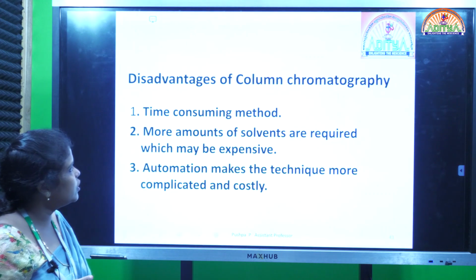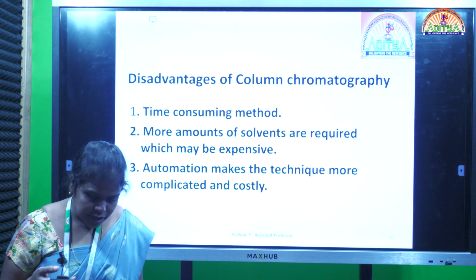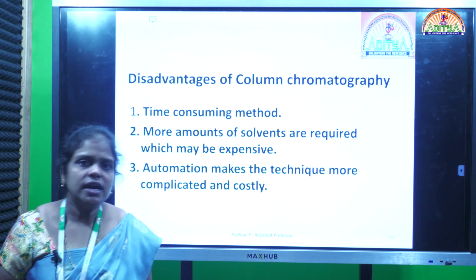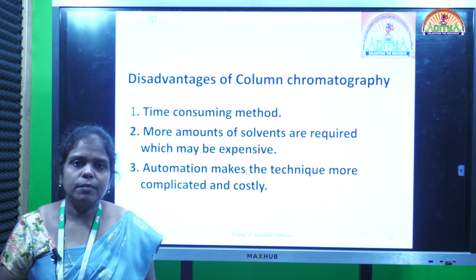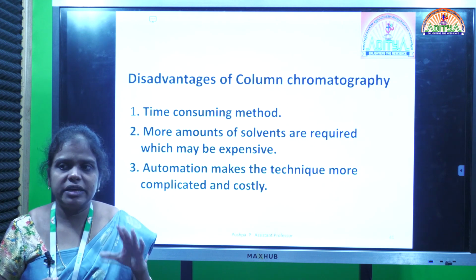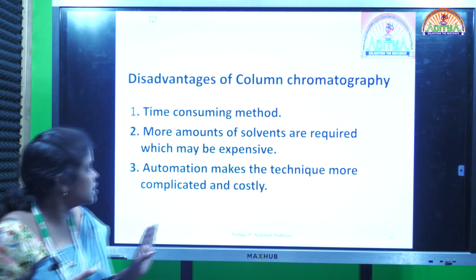And coming to disadvantages, already you know it is a time consuming process. That means it will take more time for better separation. If the mixture is having so many samples or so many components, then it will take more time for separation. And also one person should be there while this process is happening. So those are the disadvantages.